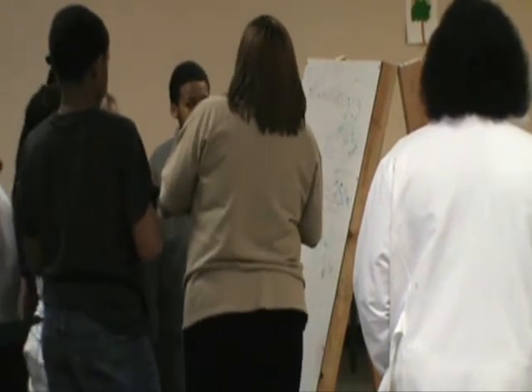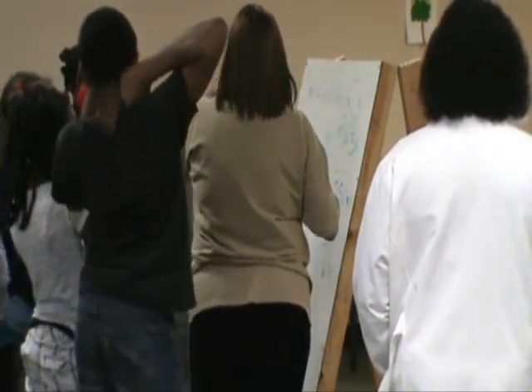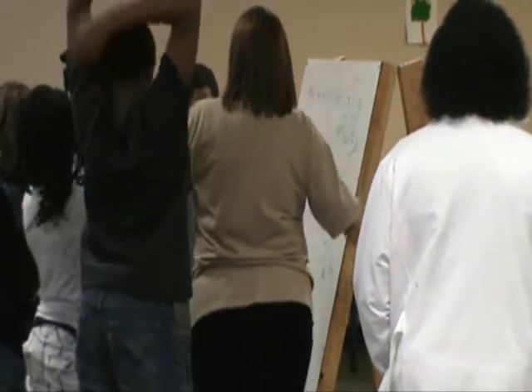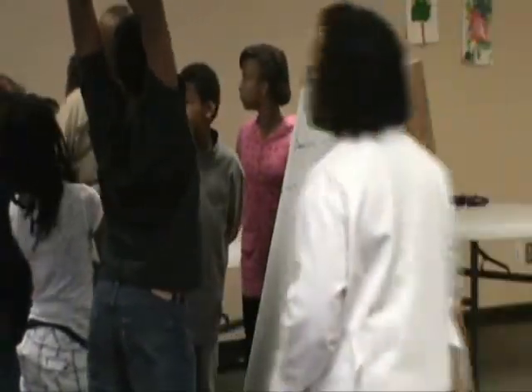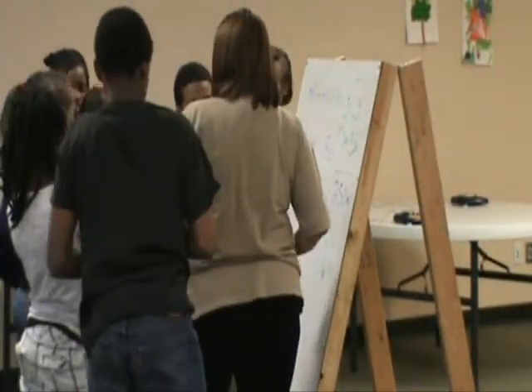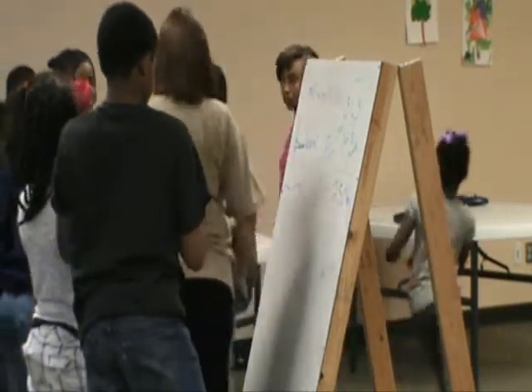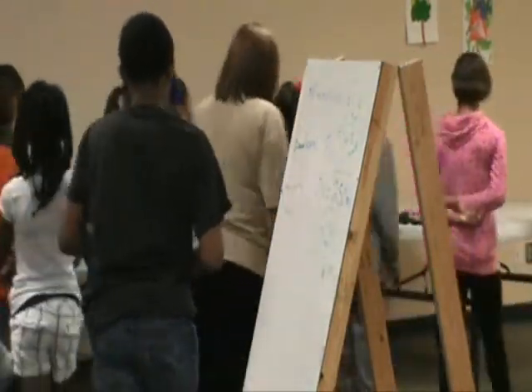Which one weighs 2 places behind the decimal? The digital or the manual? Digital? No. Now, so 31.31. Got it? Now, at this time, turn your balances on and weigh your mass. Don't run in the lab.